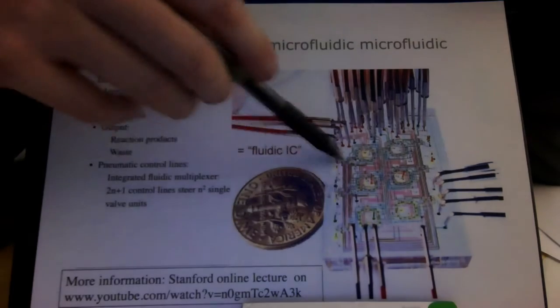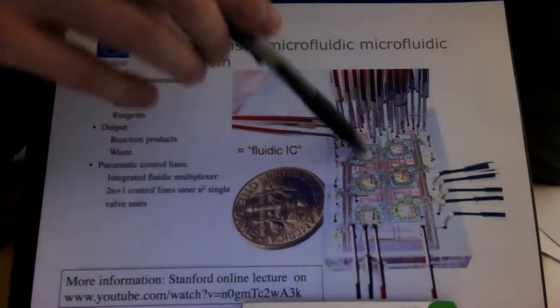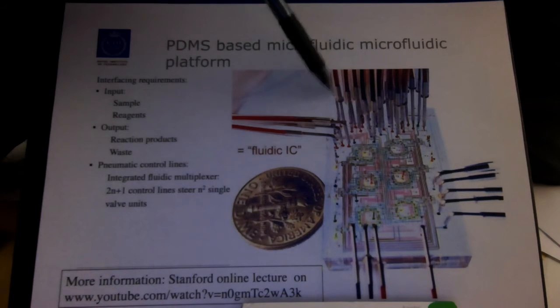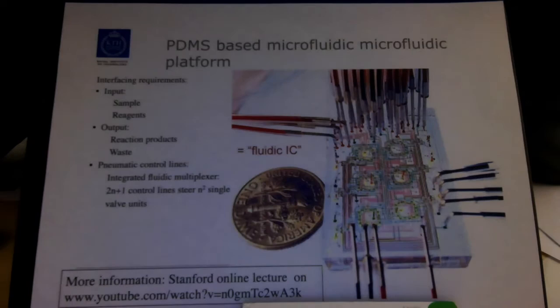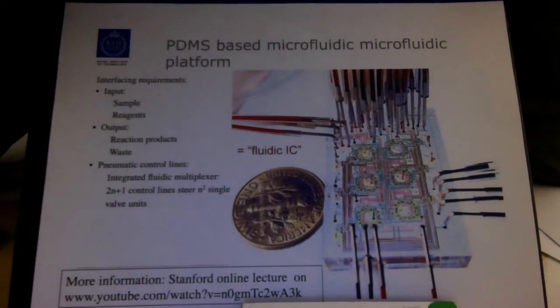And here you can see all the little colors are different dyes that are pumped in. So basically they made six very complex reactors here, and they're used for DNA processing. You can also see one of the limitations of lab on chip immediately here, because you see a very complex chip, but also I think there's about 20 or 30 different little tubes connected to the system. So just to connect all these tubes and make this leak tight and make this working, this is one of the major challenges in this kind of technology. Okay, and we're going to go more about it. This is just very cool technology.